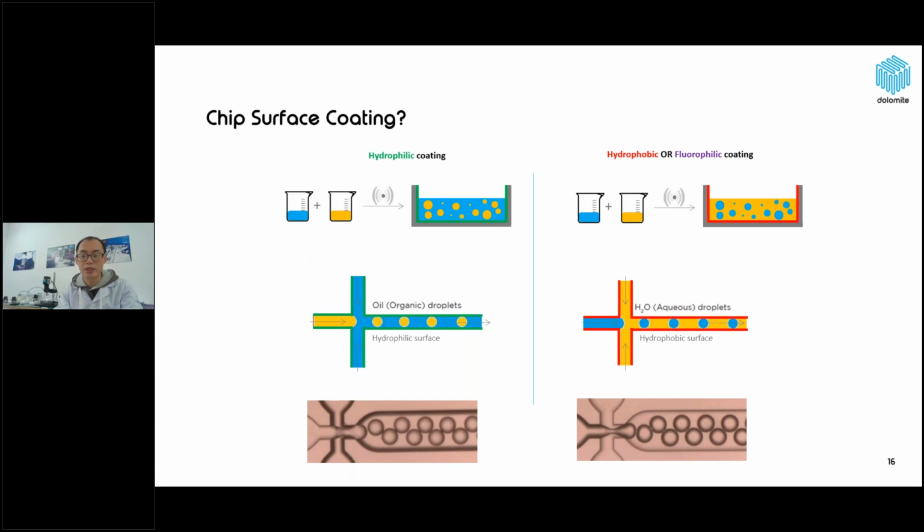In large part, this problem is automatically solved at the micro scale, where microfluidics offers very high specific area, which means the surface effect dominates over the bulk volume effect. So if the vessel has a coating, then we are able to distinguish which media would be the droplet or the bulk solution.